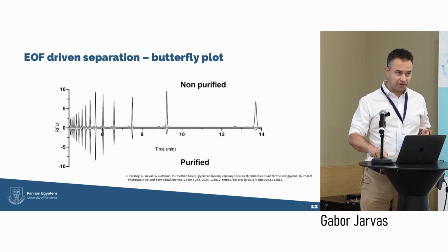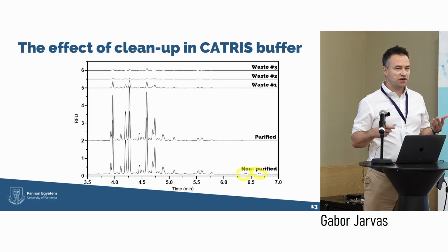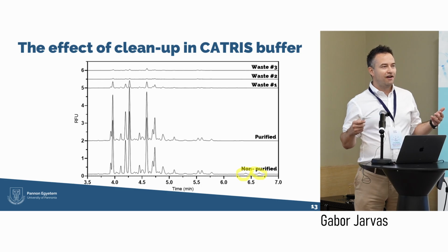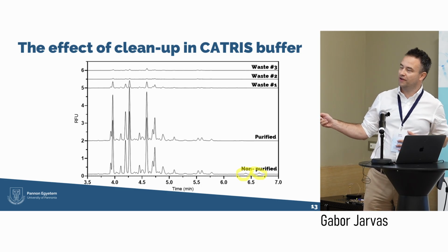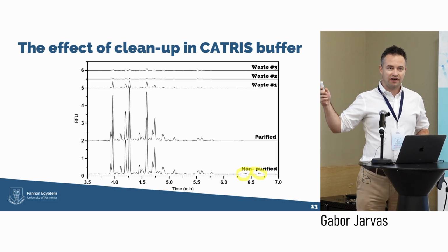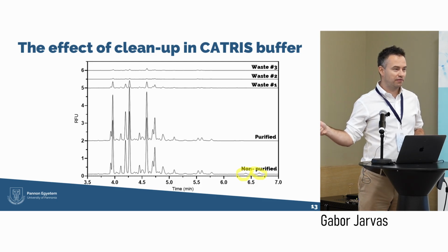And keeping on demonstrating what's going on during the sample cleanup, we further continued the investigation. It's a very logical way for us to test what could be found in the waste during the sample cleanup. And surprisingly, you see, those are the peaks that you lose during the sample cleanup.